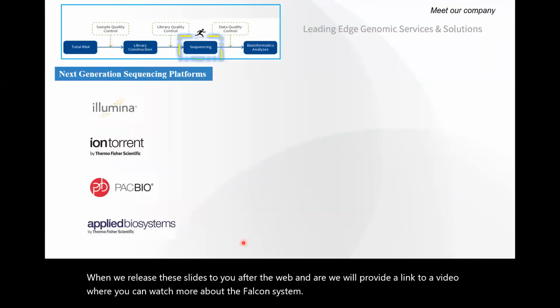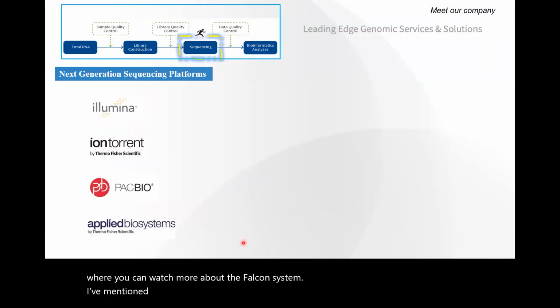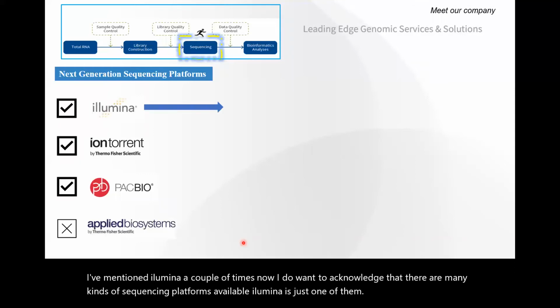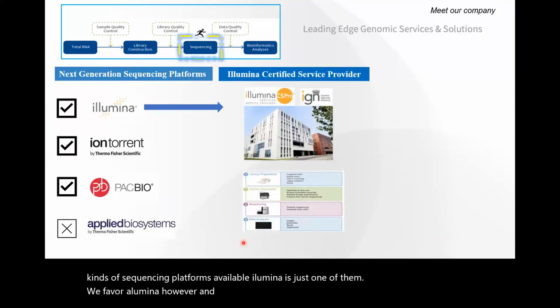I've mentioned Illumina a couple of times now. I do want to acknowledge that there are many kinds of sequencing platforms available. Illumina is just one of them. We favor Illumina, however, and we are an Illumina certified service provider. I've provided a schematic of their workflow here.